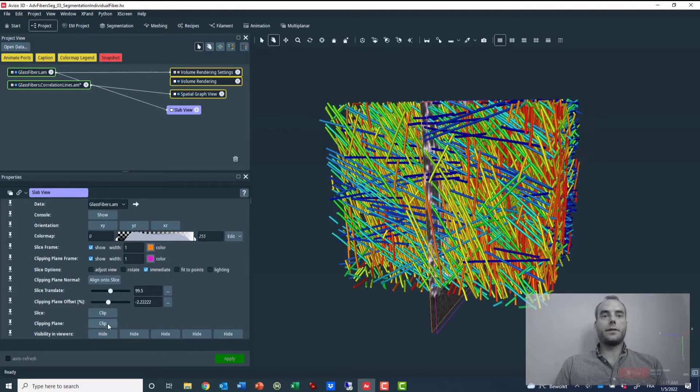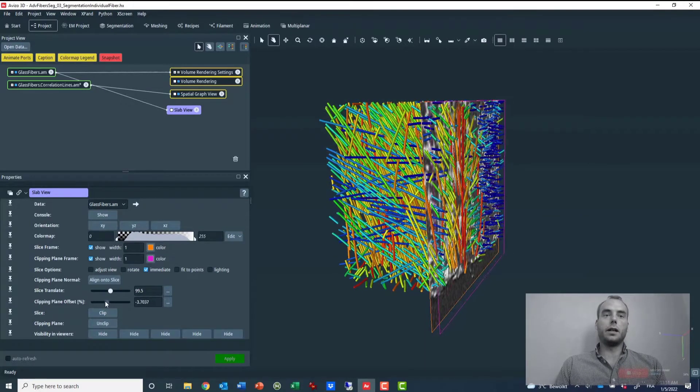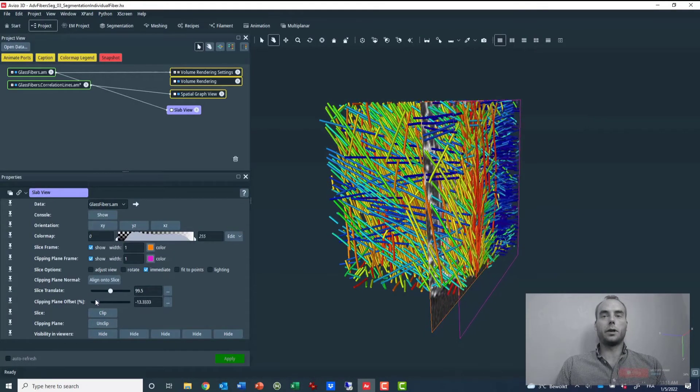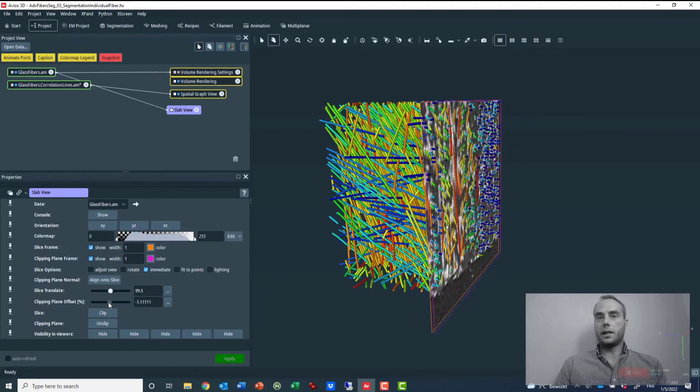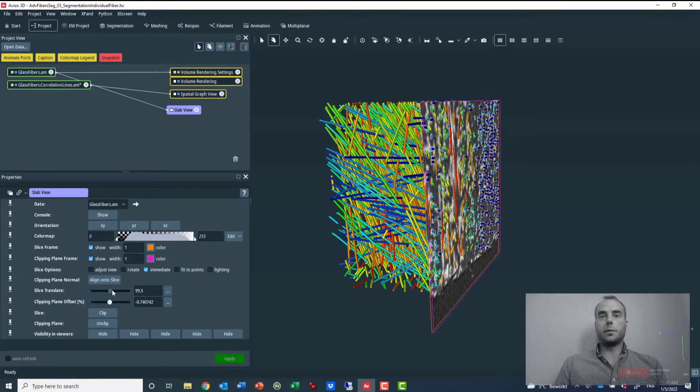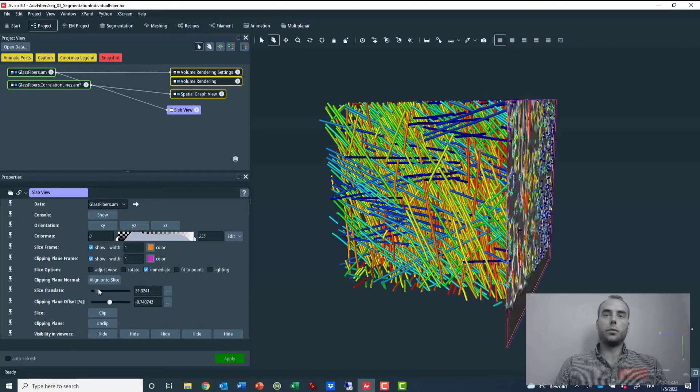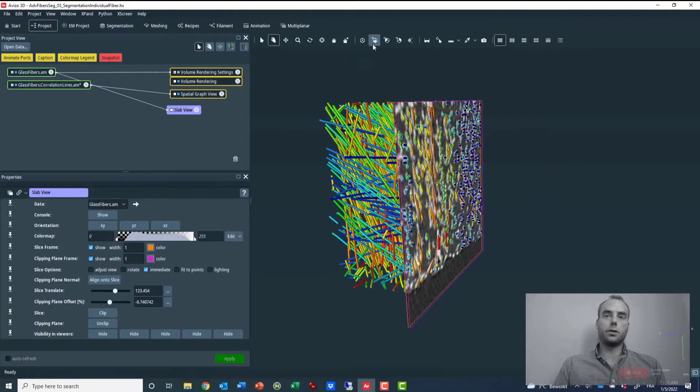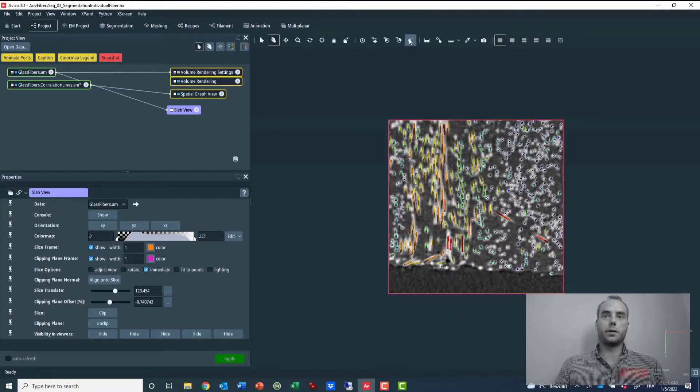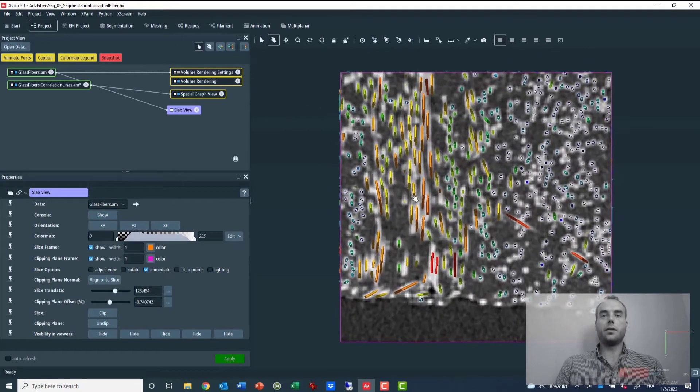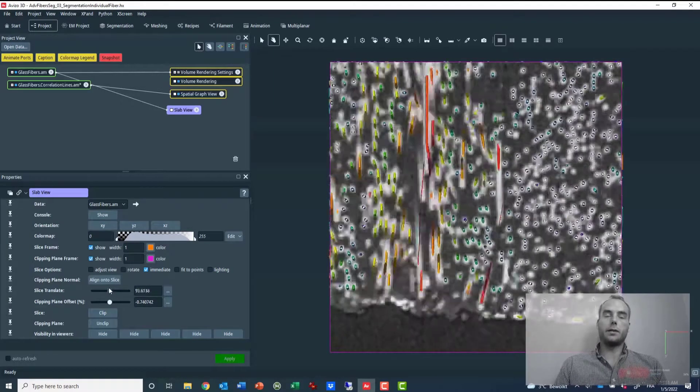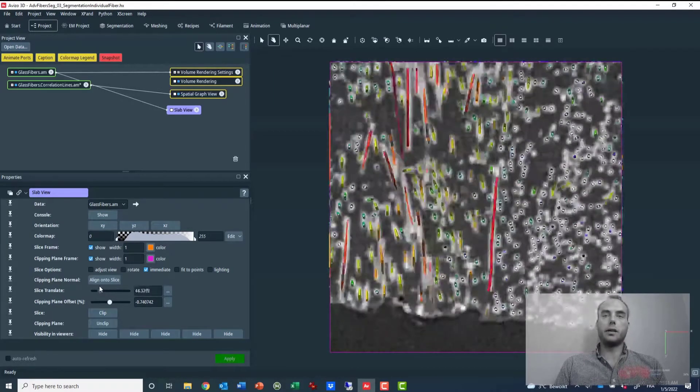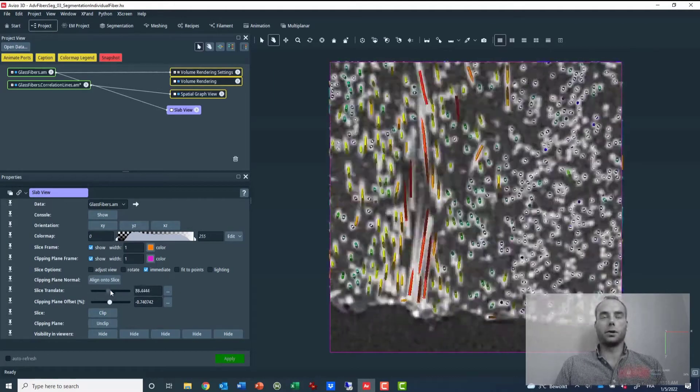Once I have set this distance, I can apply a clipping from the clipping plane, which basically enables me to display only a small portion of both the original volume and the reconstructed fibers, making it easier now to evaluate the accuracy and the quality of the fiber reconstruction.